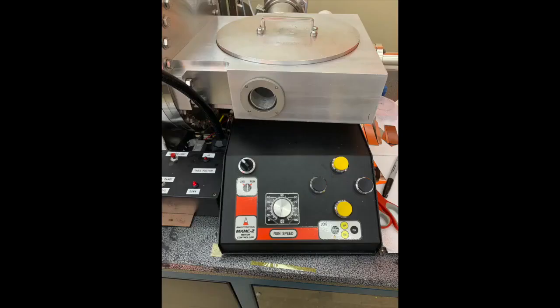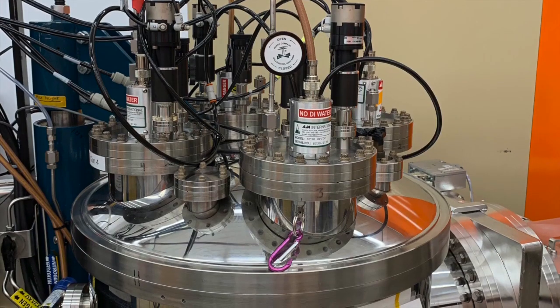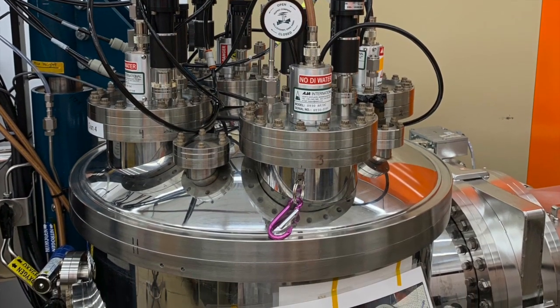So when looking at the sputtering system here, there's essentially two chambers. One, the main chamber, and the other being the load lock. The load lock is a really nice way to introduce your sample into the chamber without having to vent the entire chamber. Once the sample is introduced to the load lock, it is then pumped to high vacuum.